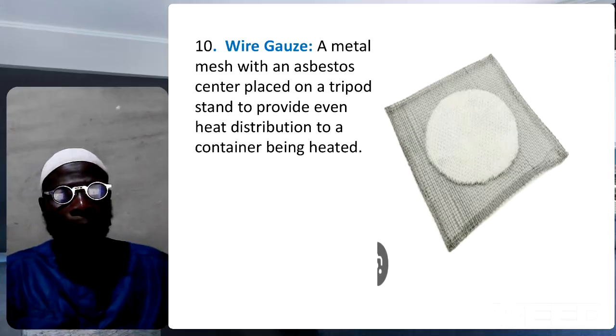It's a metal mesh with an asbestos center placed on a tripod stand to provide even heat distribution to a container being heated.